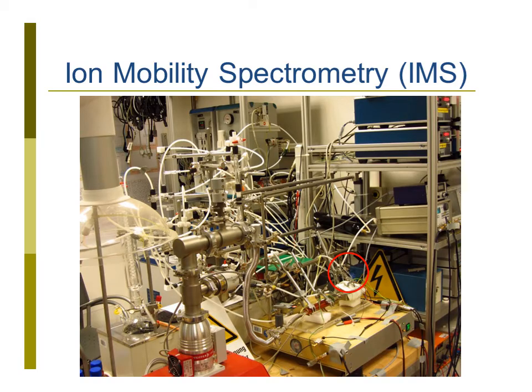This is an ion mobility spectrometer. This is the setup that I used to use. This one is now being built up at the campus in Berlin, at the GRU or GOC campus in Berlin.